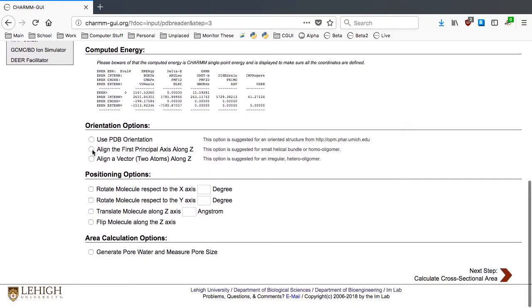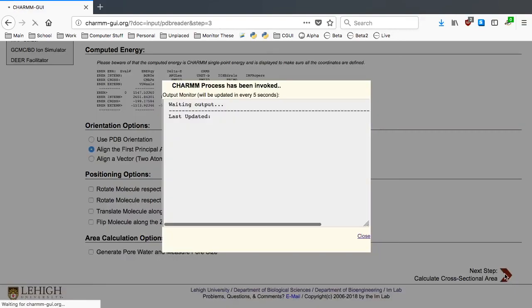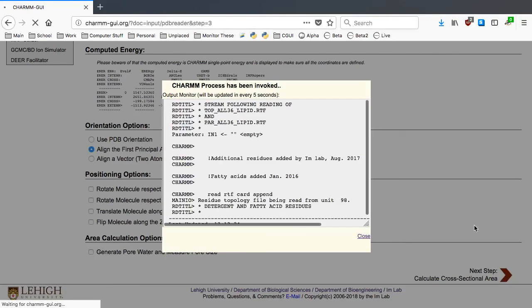CHARMM-GUI provides a few options, and we will use the option for aligning the first principal axis of our protein along the Z-axis of the system. Because we have a pentameric CTB, whose principal axis can be easily defined, it is good to use for this alignment.